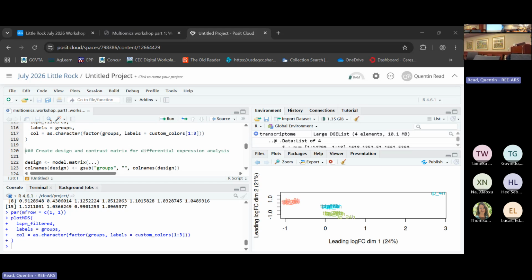Every time I've run this, I've got the same. That's interesting. So you got the same? Yes, it might be a mirror image, that doesn't matter, but yours is just different though. So something you may have done differently in the pre-processing.